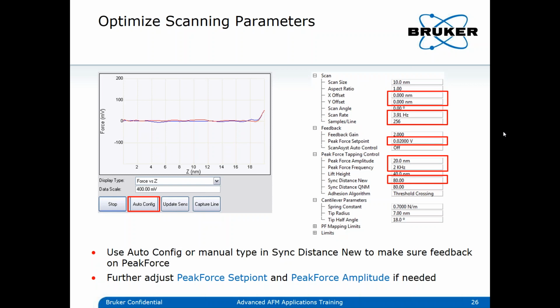If you have a contamination on your probe, usually this is getting kind of tricky. From my experience, I can say that UV light would help. So if you would put them under an ozone light, where you create ozone, you would again get rid of the contaminations. I know there are people who were using a dried ice gun for that. I never personally went there. Again, try it with UV light or with carefully rinsing in clear water, see if it gets rid of the contamination. On the other hand, most of the times, look for a new probe. Actually, it's the easiest way.